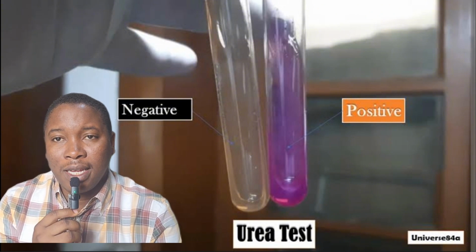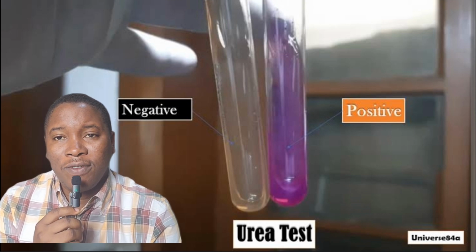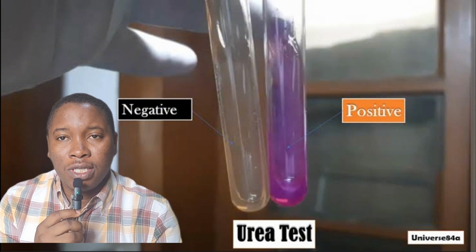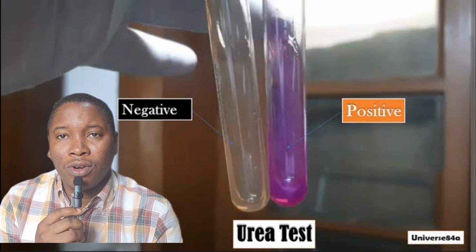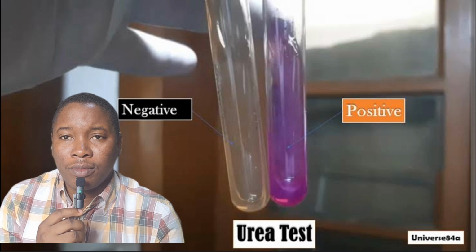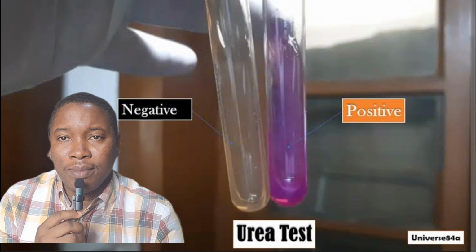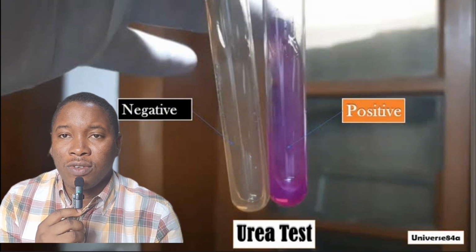Now, in the urease test, like I said, for many of the organisms, the idea is determining if a microorganism has a particular enzyme, or if it's able to break down a particular kind of sugar. In the case of the urease test, we're asking whether the microorganism has urease as an enzyme. Urease helps microorganisms break down urea. Urea is a complex nitrogen compound that can be found in many organisms and can be used by many organisms as a source of fuel, as a source of nitrogen.